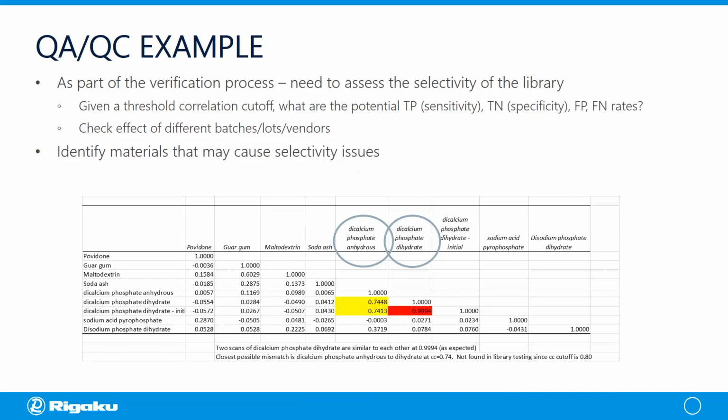So all of these spectra from the previous slide were put into what's known as a correlation map. And the question becomes then, what should the cutoff threshold be set to clearly differentiate these materials? And our secondary question was, are these materials correct in what they previously were, even though we've changed our vendor. So in this example, we start with a cutoff correlation by default of 0.8.